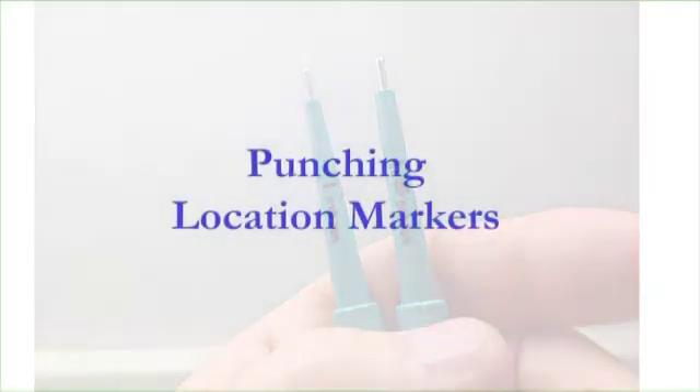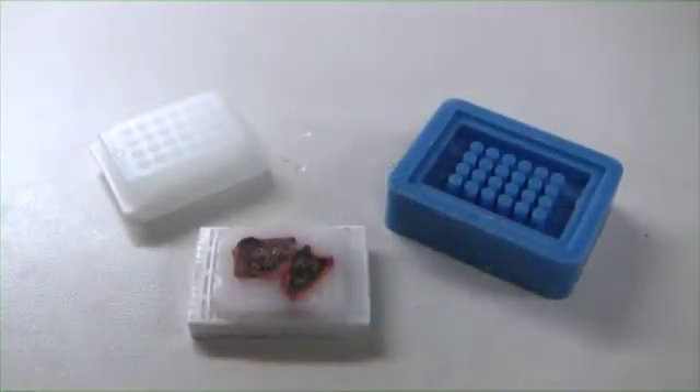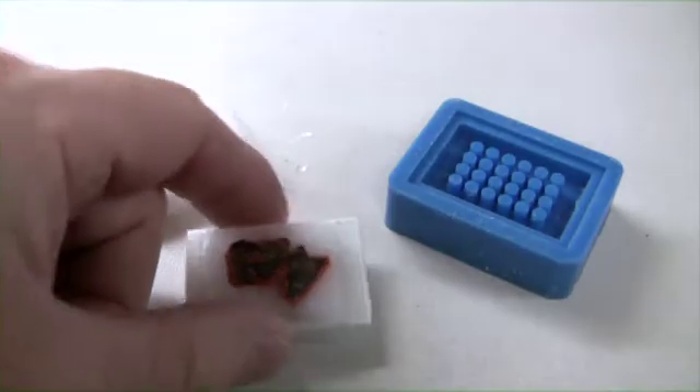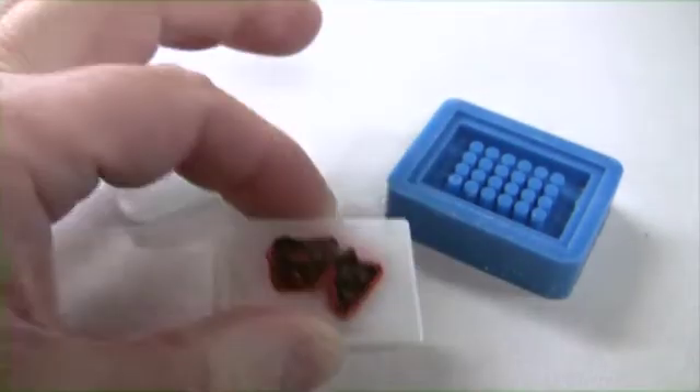Always punch the location marker first before you add any tissue to your tissue microarray, just in case you crack the block. This is dyed lung tissue — any tissue will work for this purpose. We are using the 1 millimeter and the 1.5 millimeter needle for the location marker.